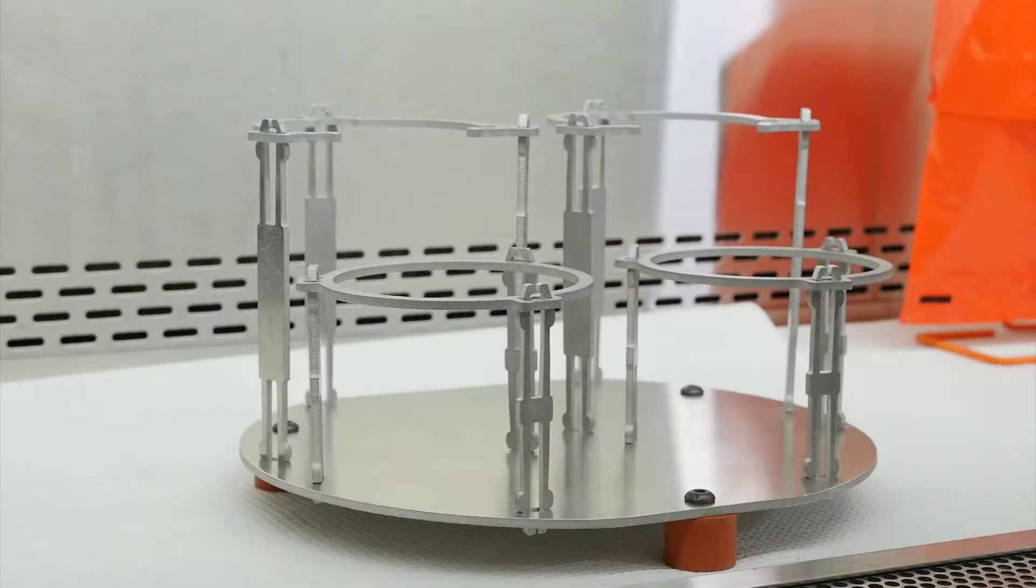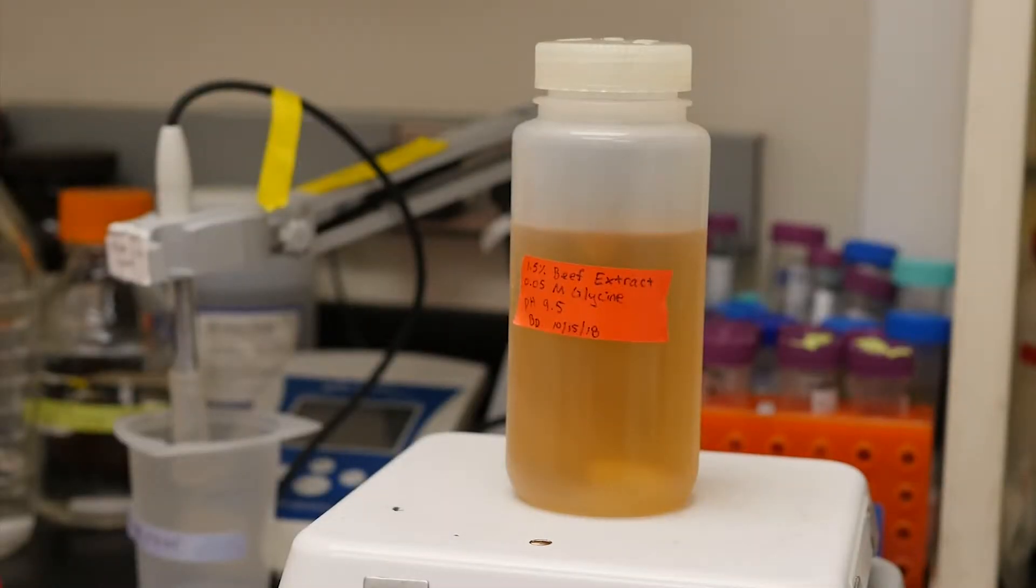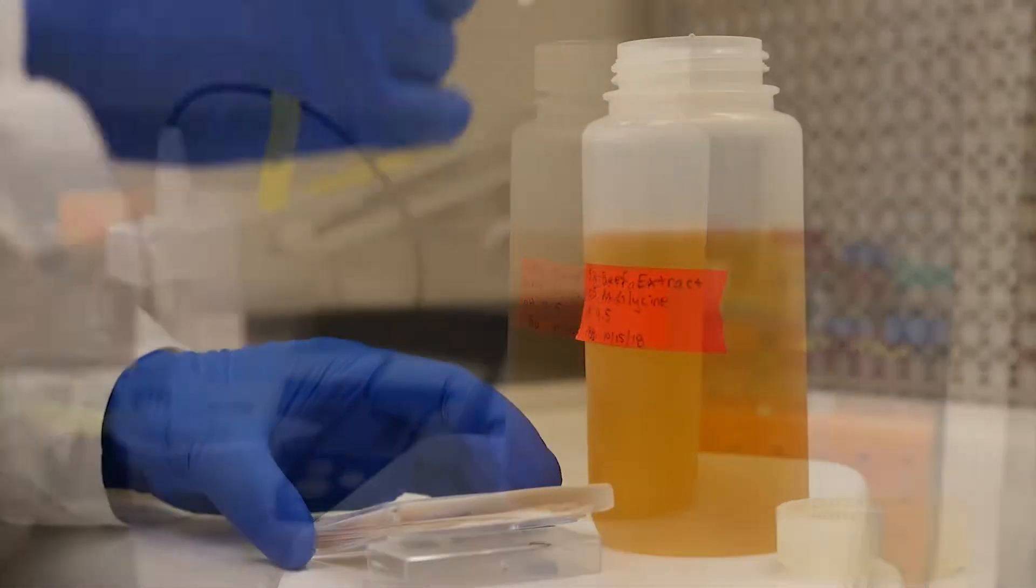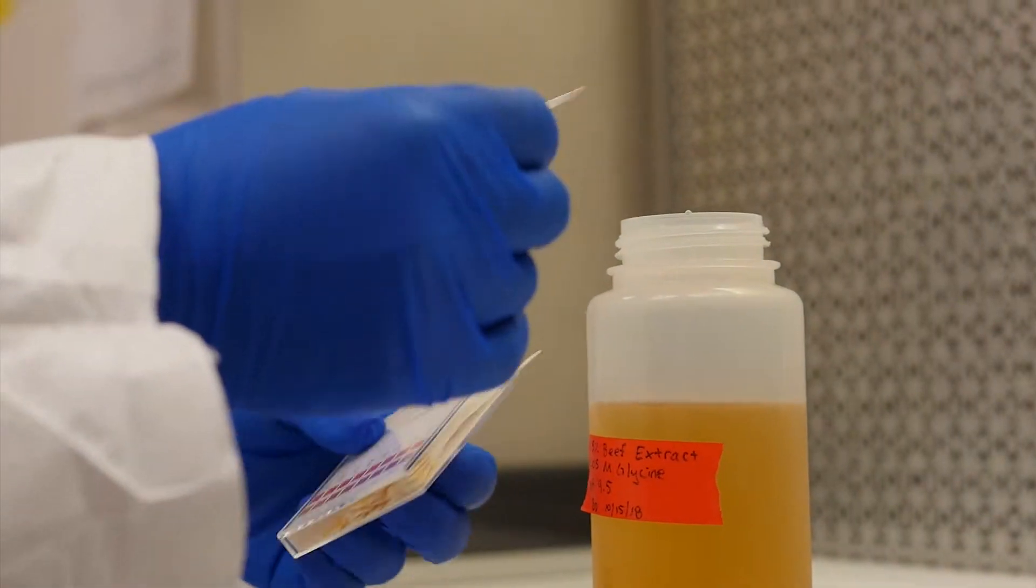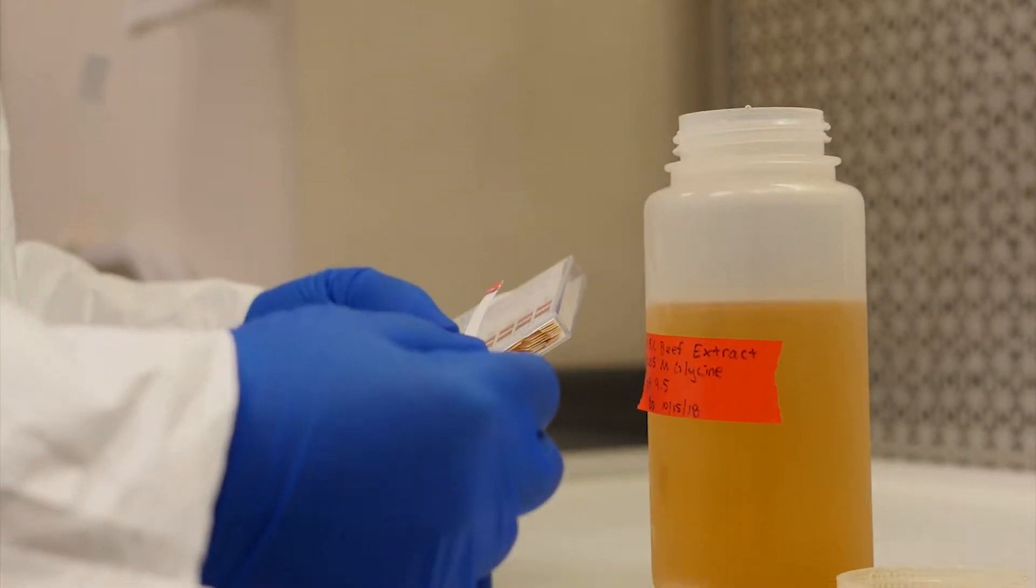Now that we have reviewed biosafety techniques and ways to prevent cross-contamination, let's go over the steps necessary to prepare for elution. Prior to elution, prepare your eluent. This is a 1.5% beef extract solution with 0.05 molar glycine at a pH of 9.5.